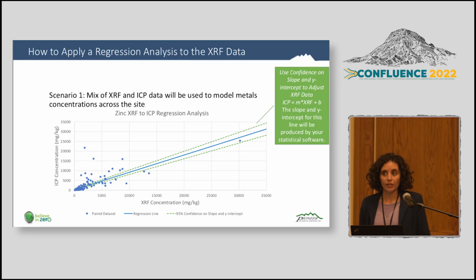And this is that confidence band. You're 95% sure the regression line falls somewhere between the upper and lower green dashed lines shown here. So using the upper 95% line, you're being a little bit more conservative when importing that XRF data into the data set and modeling it.